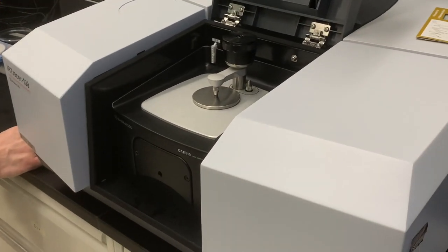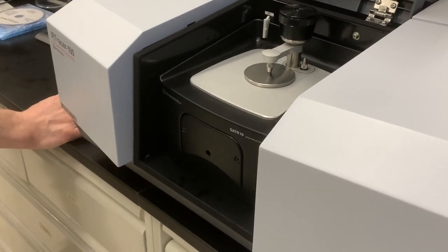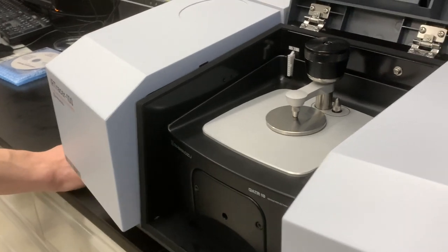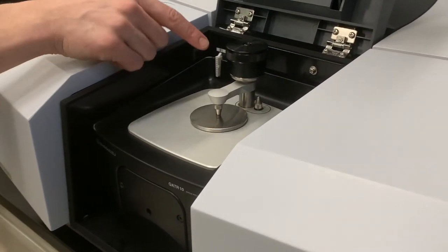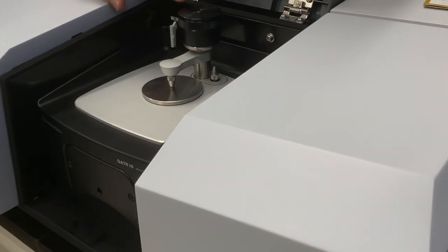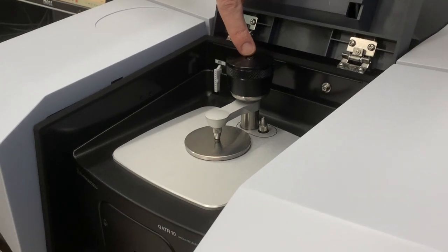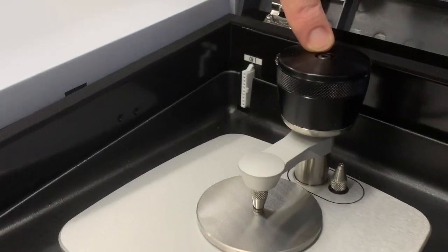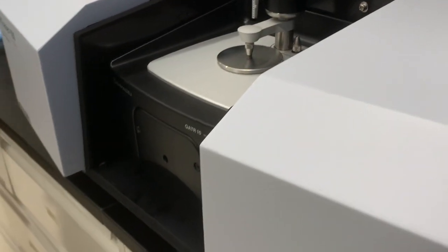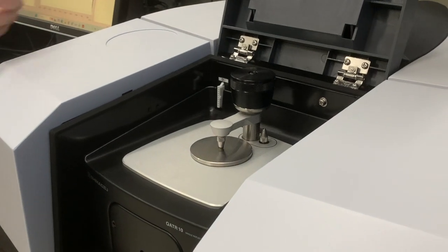Yeah, I can wrap my head around it. It's a thin film, a nanometer. The whole thing, I'm just interested. You apply too much pressure, yes, it can damage those. That's a good question. I'm not sure what the torque setting is. It's not recommended, but I believe you may be able to loosen this hex screw on top and adjust the torque. But I would double check, yeah. I would wait unless you find that it keeps cracking your wafer and then it's necessary.